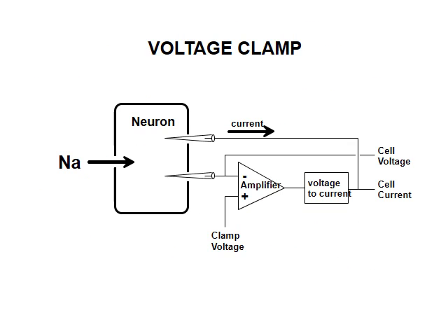This circuit illustrates the basic principles of the voltage clamp technique, and I'd like to walk you through this circuit so you understand how the negative feedback circuit allows us to clamp the voltage of a neuron to a desired value, and how we can measure currents flowing through open channels in the neuron. What we see here is the neuron we want to voltage clamp, and we are inserting two electrodes into the neuron to measure voltage and to inject current.